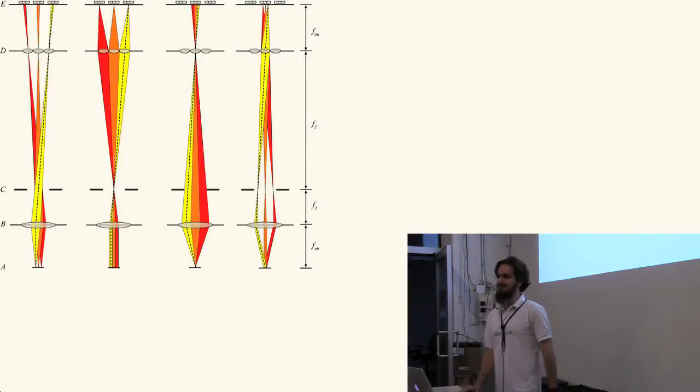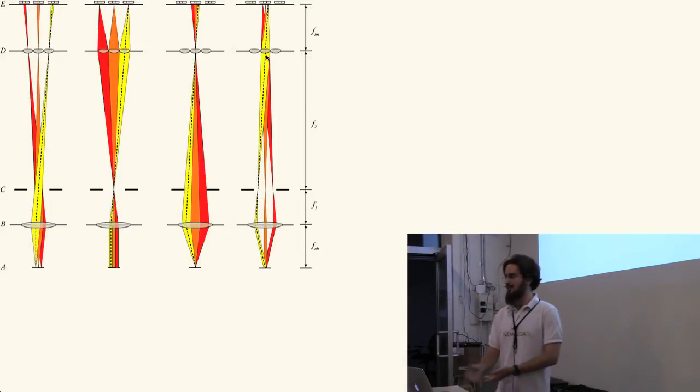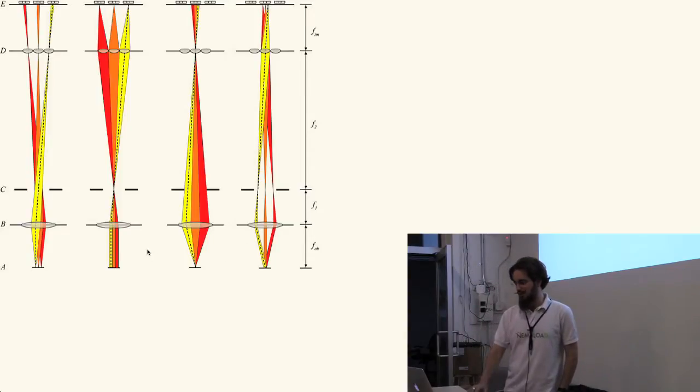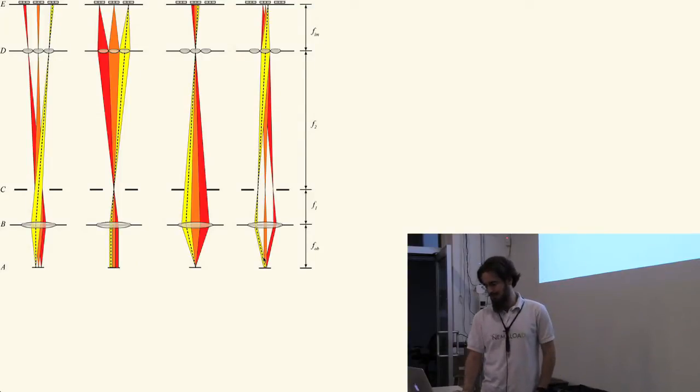Now, in order to do that imaging, because the neurons happen to be arranged in 3 dimensions, we have to use some clever optical techniques. This is called light field microscopy. Typically, when light reaches the sensor plane, which would be here, and one marked D, the angle of the rays is information that's lost. Whatever angle they come in, they activate the sensor, and you get the same result. But if you put a micro lens array at the sensor plane and put the actual sensor behind that, the result is you get these little micro images where the position of intensities in that micro image tell you what direction it came from, and that allows you to actually invert the optical process if you have some bounds on the distance of light sources from the focal plane, and you get a 3-dimensional thing.